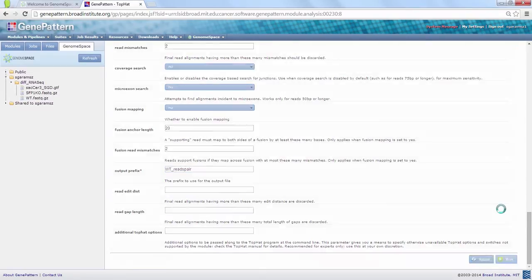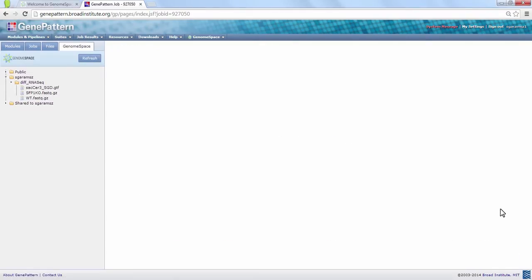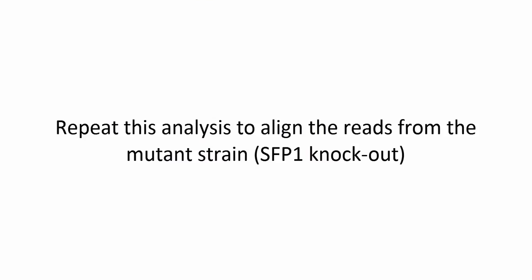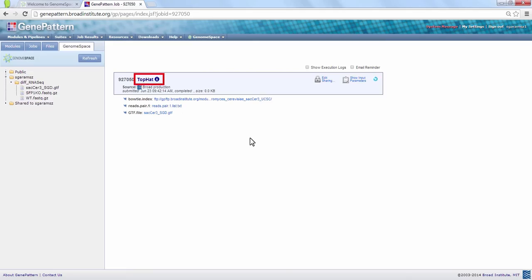A spinning blue circle next to your job indicates that it is running. Now, while our job is running, we will start up another TopHat job to align the reads from our mutant strain.